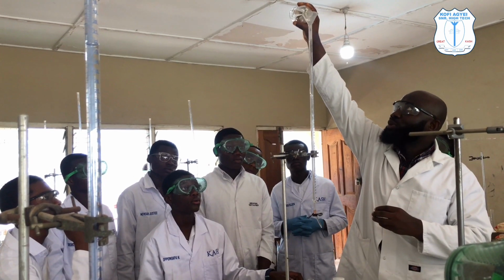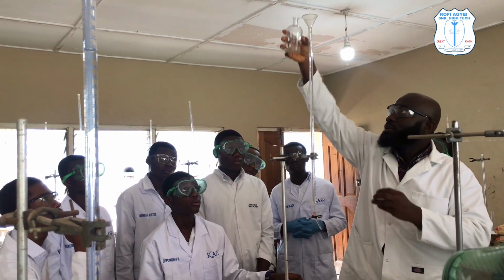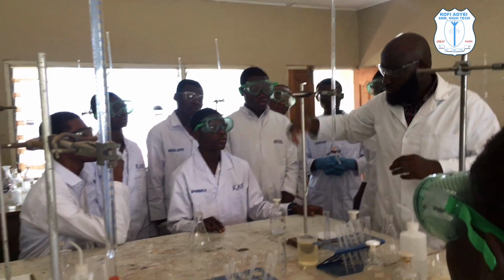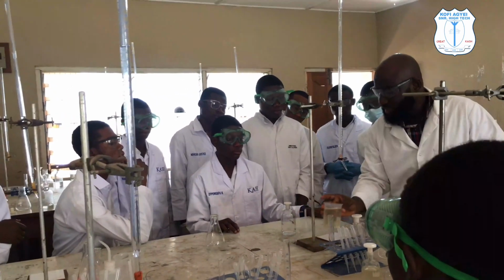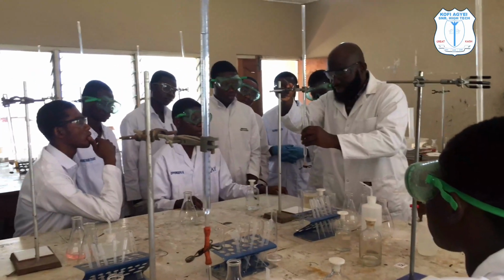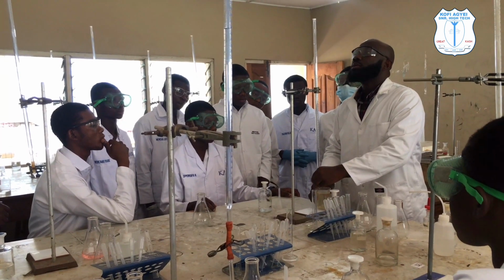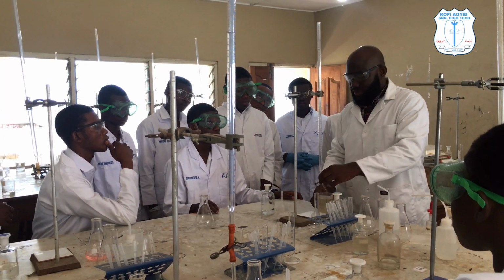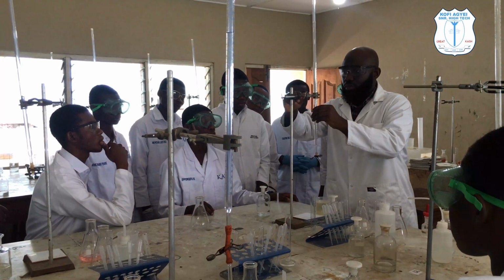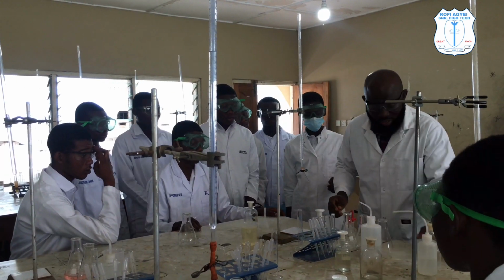Now when you're pouring, please pour it gently. After pouring, you remove the funnel. Then you adjust it nicely to the 0 mark. So here the clamp, you loosen it nicely. Do you get it? Then you adjust it to the 0 mark. Then you readjust it nicely. So the next step is to pipette the base.